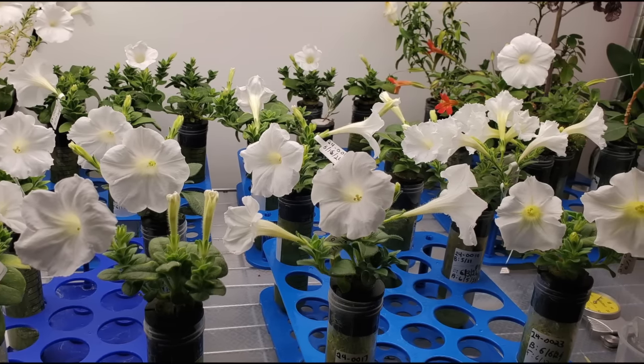And I coat it with the plasmid, and I use this extract from salmon sperm called spermidine, which I know is super weird. But it's a chemical that allows for DNA to glue onto things, right? And evolutionarily, that makes sense because you want the sperm of salmon to bind to the eggs of salmon, where all of this is happening outside of both of the salmon's bodies, right?